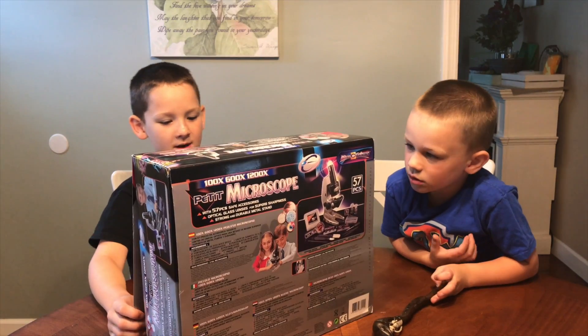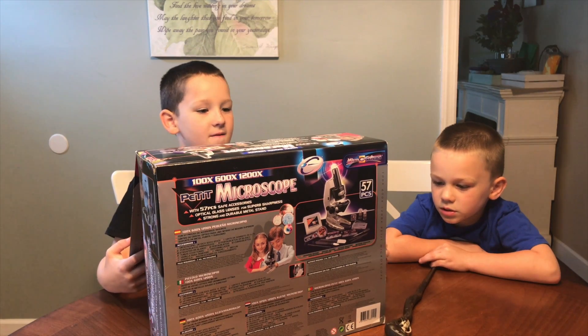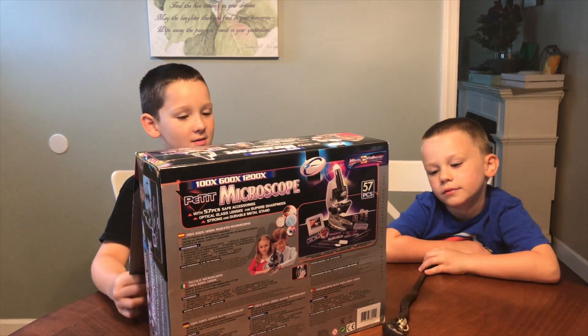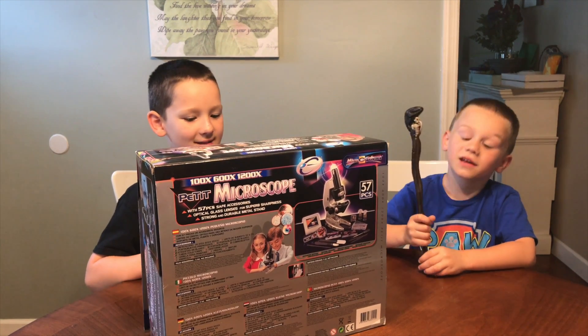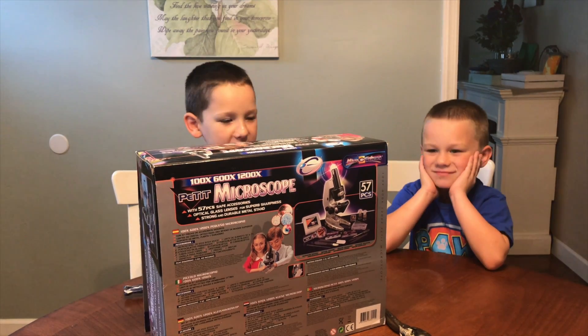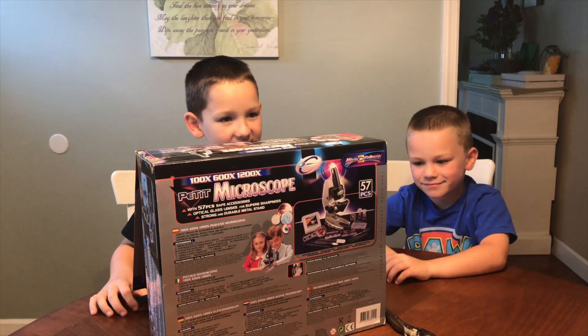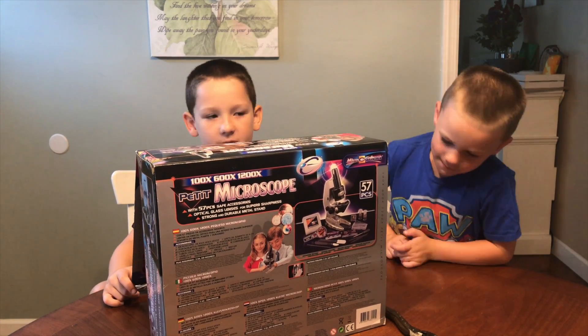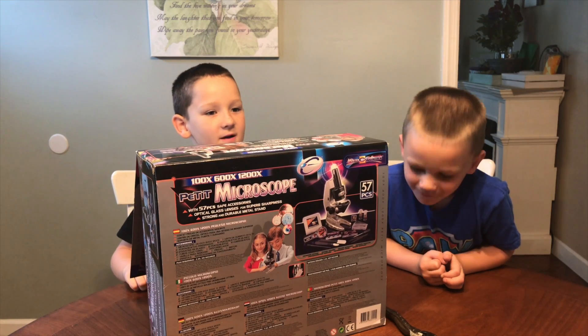Let's go over to Microscience! Petite Microscope — it magnifies 100 times, 600 times, and 1200 times. It contains 57 pieces and it looks like it's got a nice strong metal base. For any little geeks that don't know what a microscope is: the microscope is a very strong magnifying glass that can see tiny things that a magnifying glass cannot.